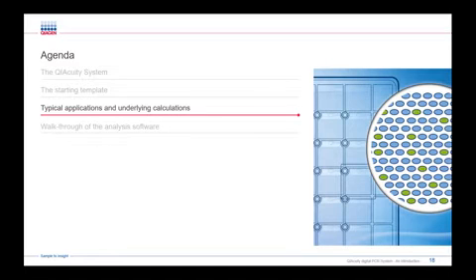With the next set of slides, I would like to give a short review of some typical applications in dPCR and the underlying calculations. In the upcoming months, we will offer some more detailed seminars on those various application types.